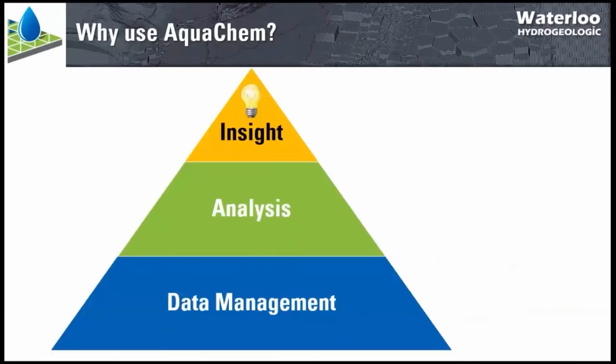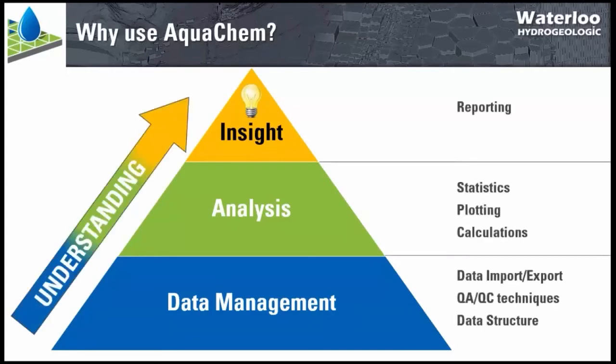The basic approach of AquaChem is to have a data management pillar that allows you to do analysis, which then provides you insight. That leads to a greater understanding of your data and also allows you to share any insights you have with your project stakeholders.